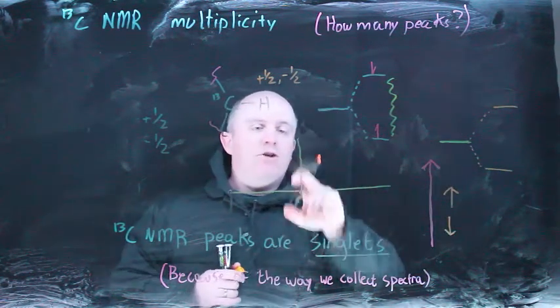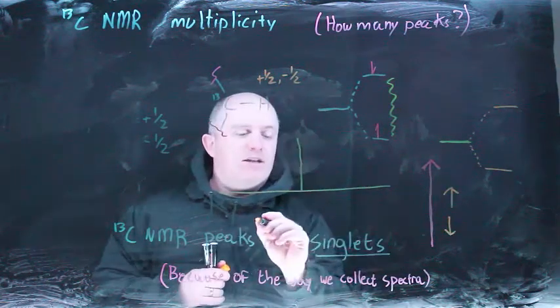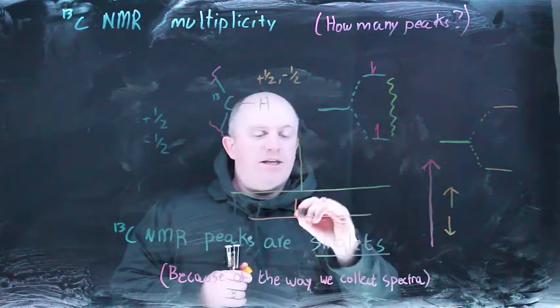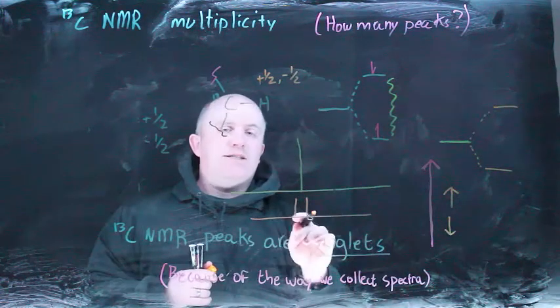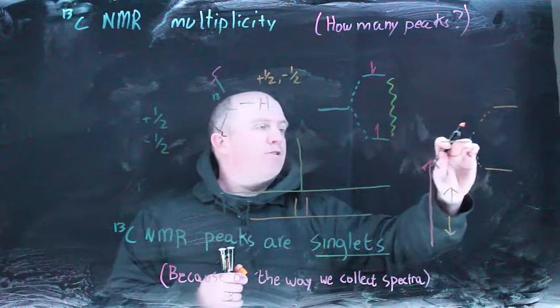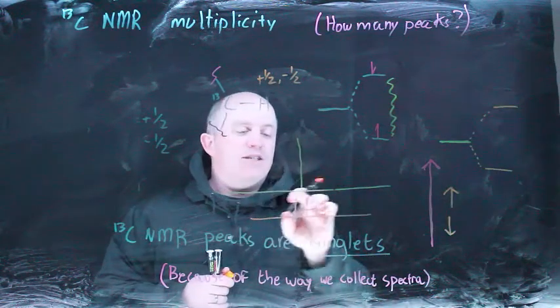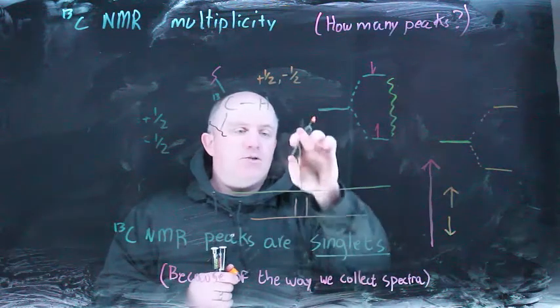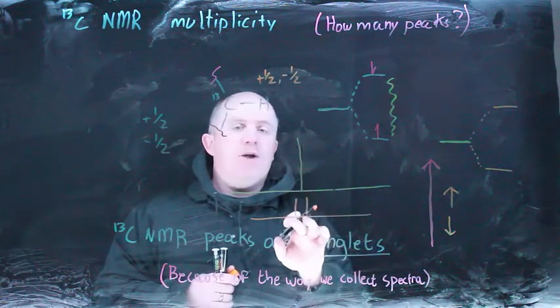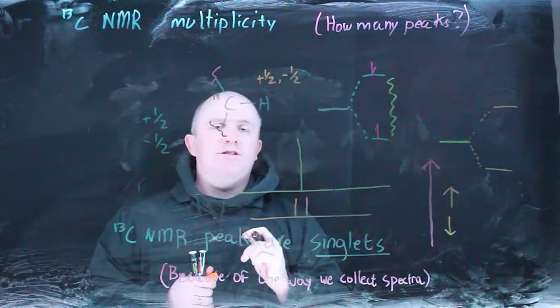It goes from looking like a single line in the C13 spectrum to instead looking like two lines in the C13 spectrum, split slightly apart versus where that original line was. If here's where that carbon was going to be, now you have two energy levels, one slightly above and one slightly below. So if this is where the carbon resonance was going to be observed in the spectrum, now you have two such lines. So your singlet becomes a doublet from the influence of a single hydrogen.